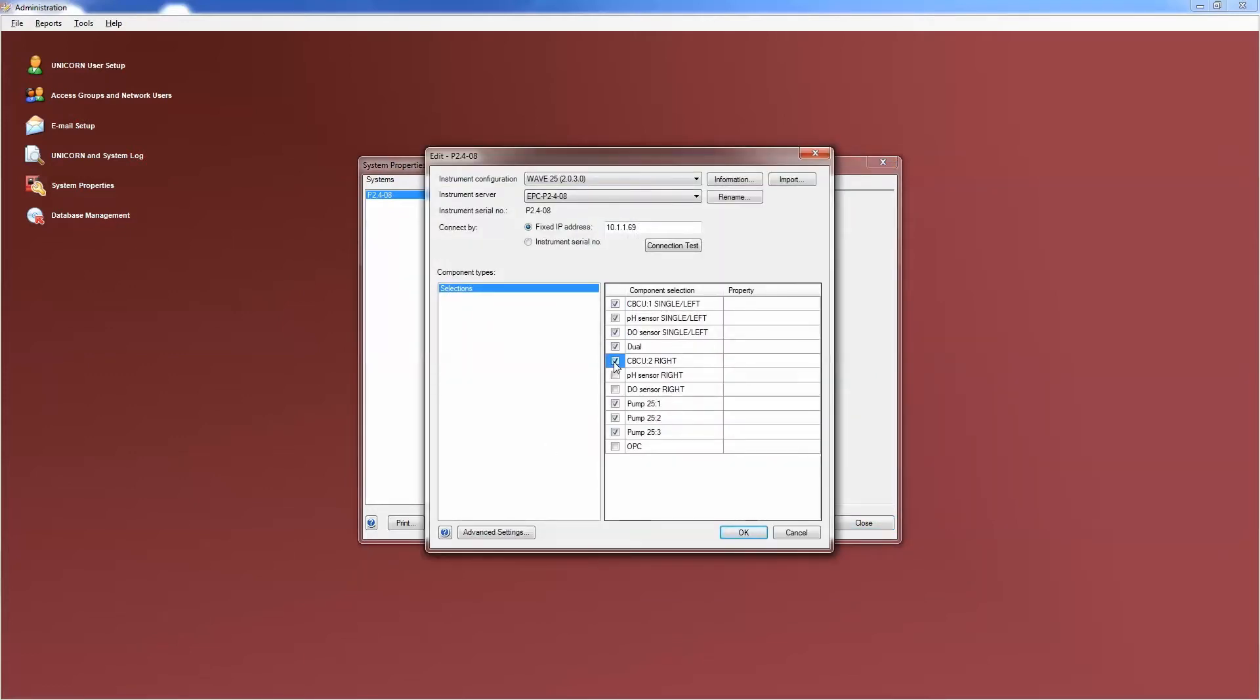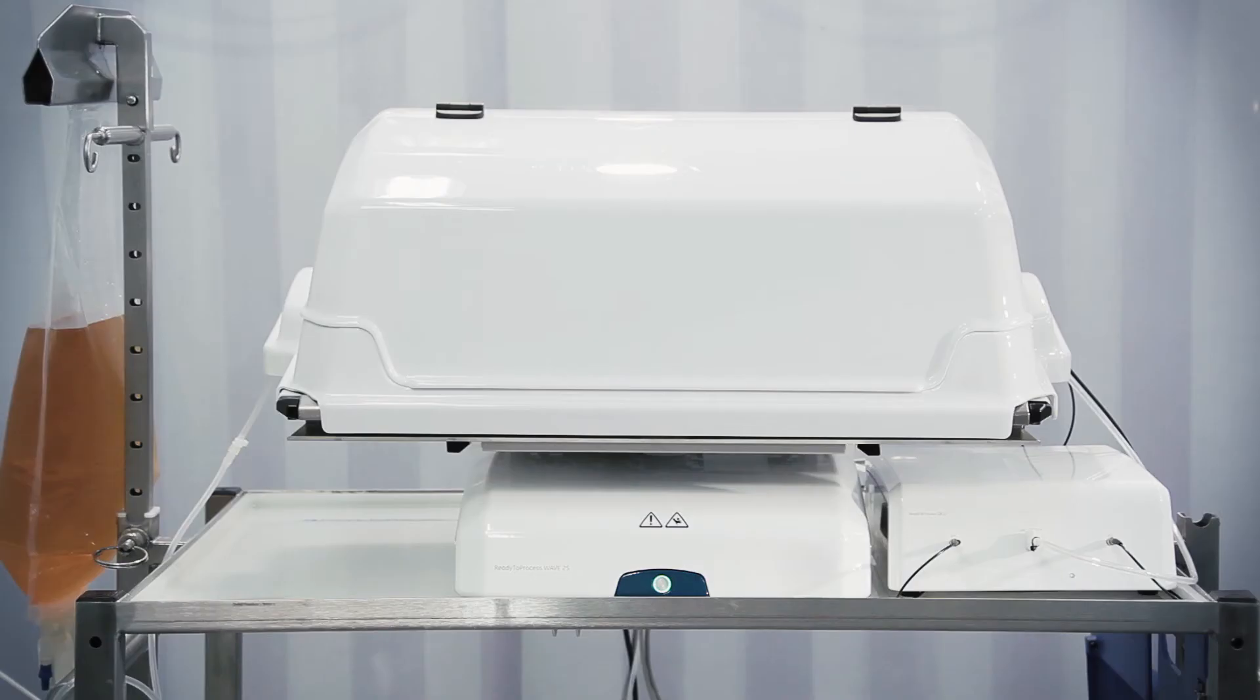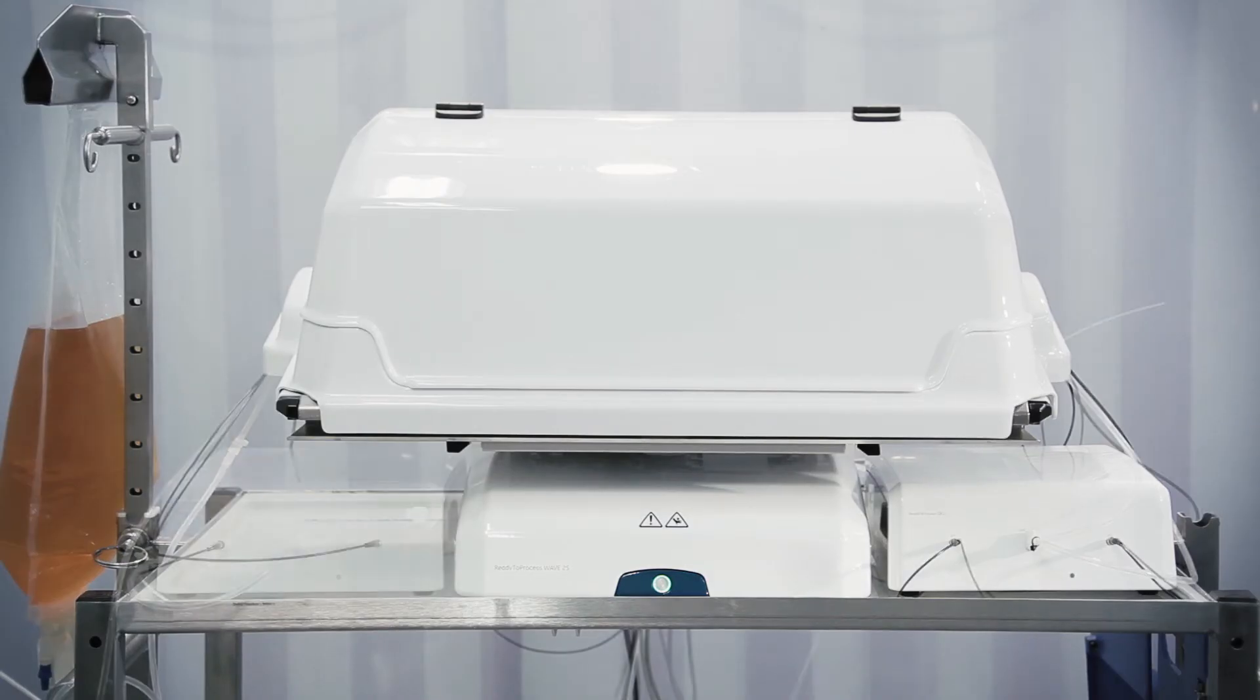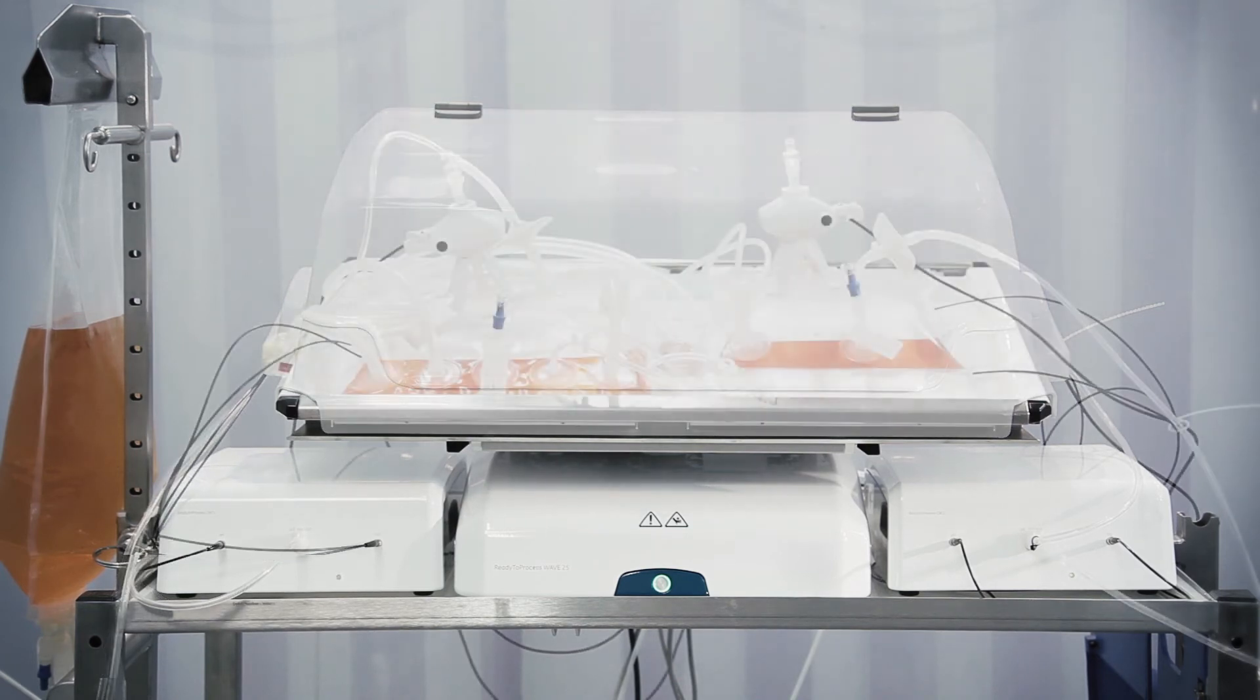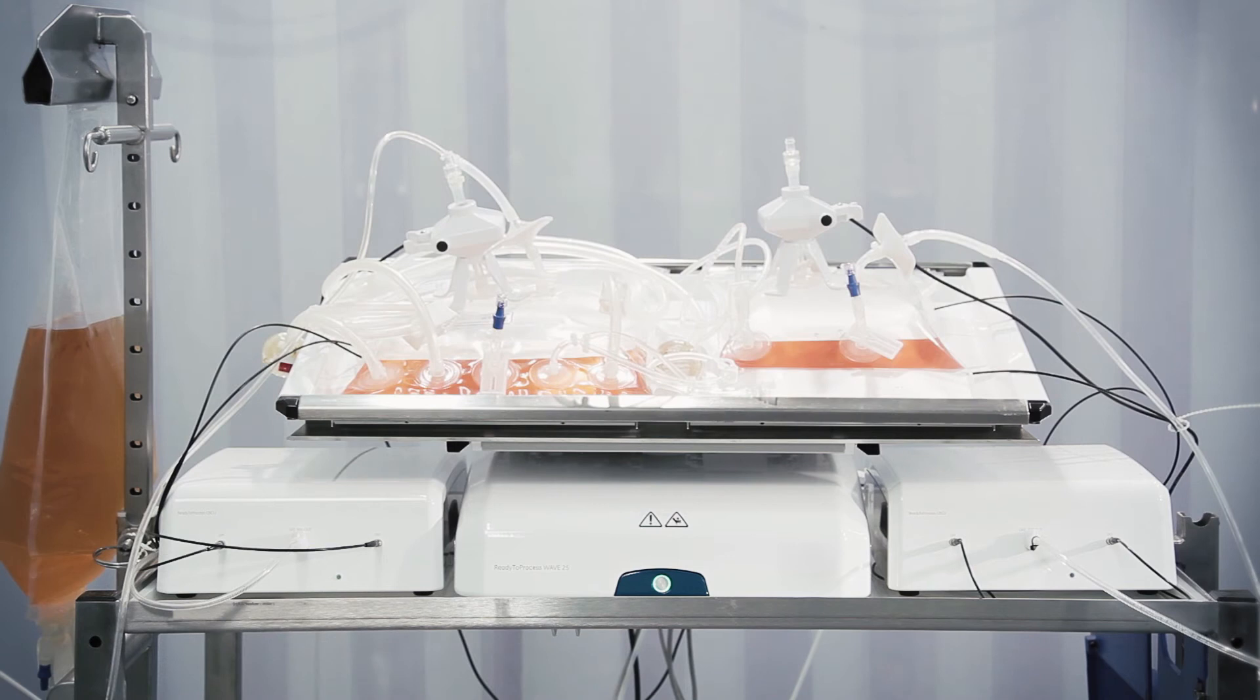Now the control units and sensors can also be selected. In dual mode, the rocker is connected to two ready-to-process CBCU units for accurate and independent control of culture conditions in the separate bioreactors.